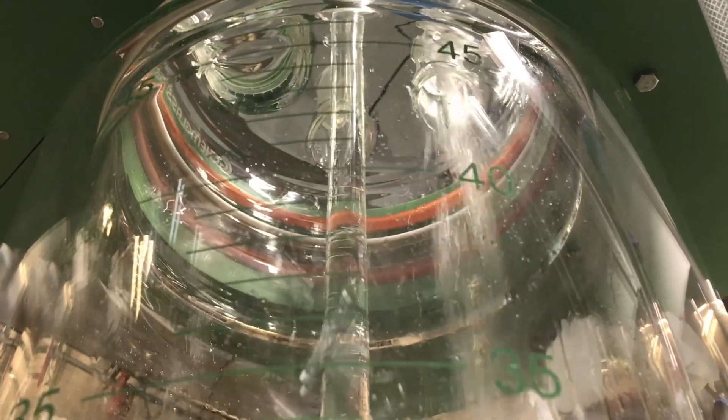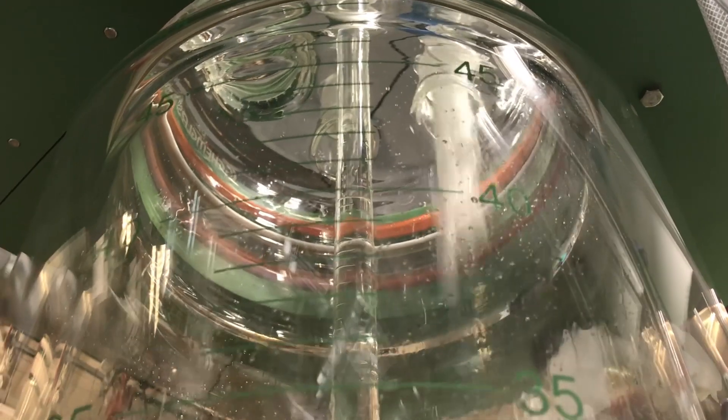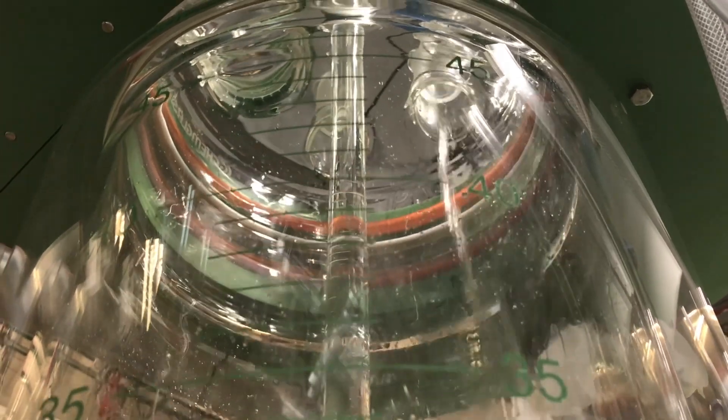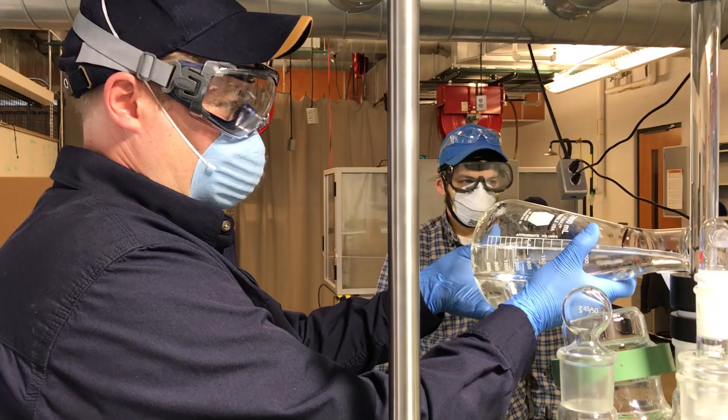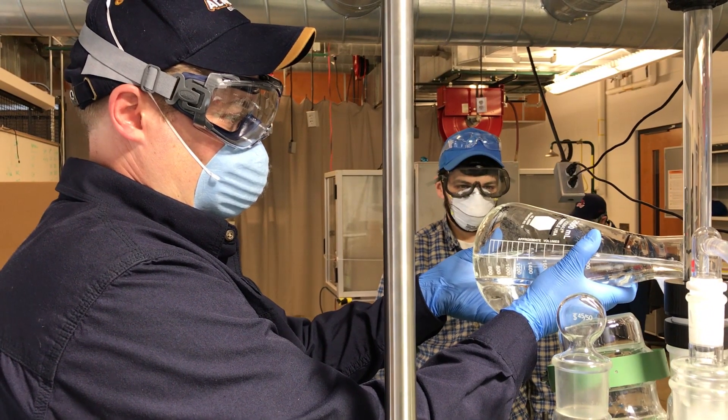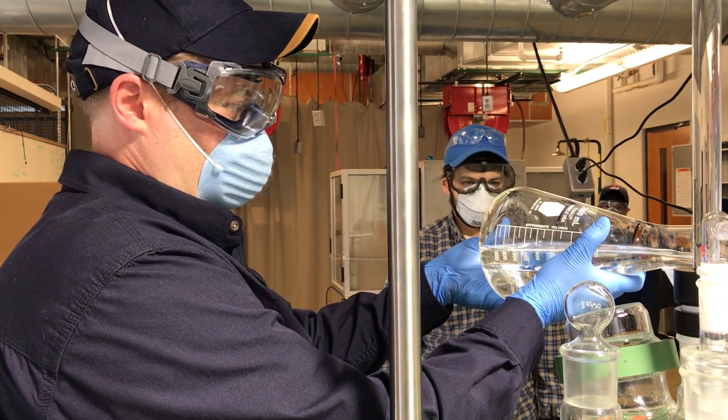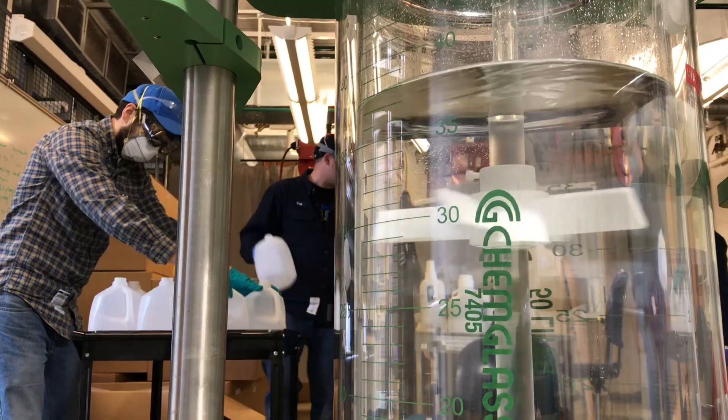Then we fill the reactor with a measured amount of ethanol, starting with 95% alcohol. We add the other three ingredients and fill the rest with water, then mix for a few minutes to ensure a homogeneous mixture.